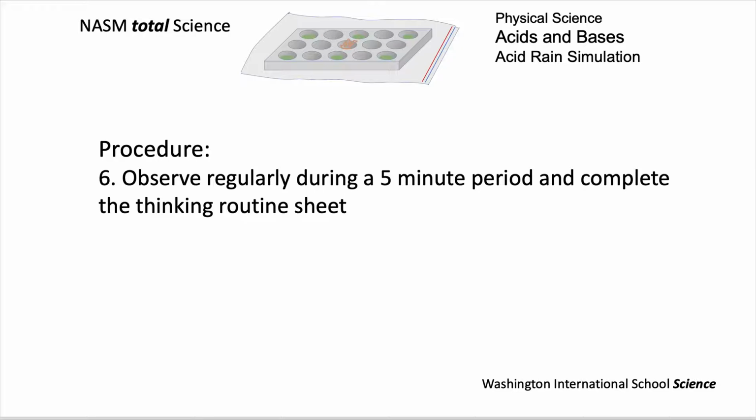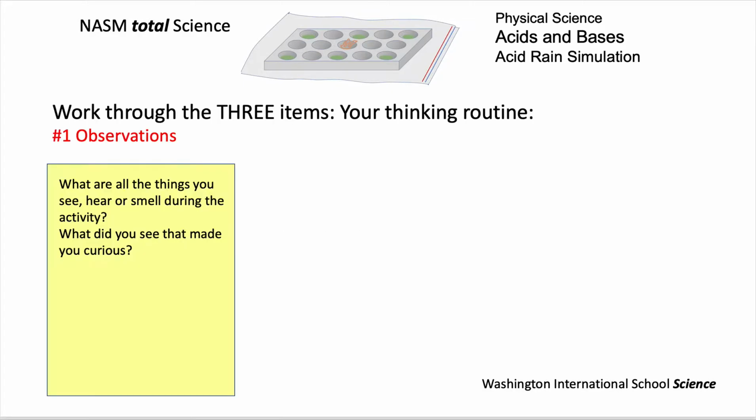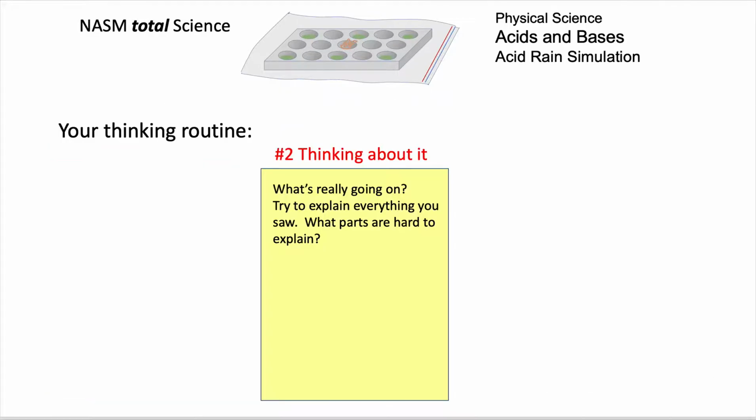And you're going to observe during a 5-minute period and complete the thinking routine with your observations throughout the activity. So let's read the thinking routine instructions. And so what do you see here? You won't smell much because it's in a fume hood.